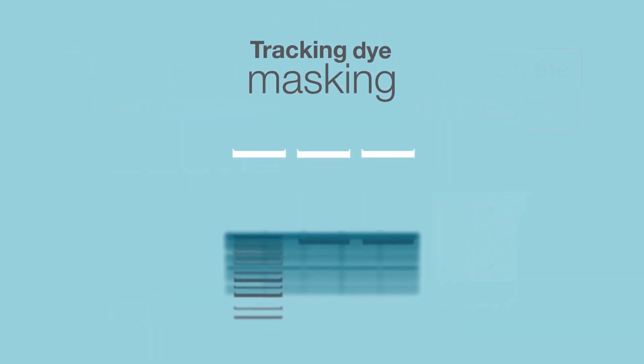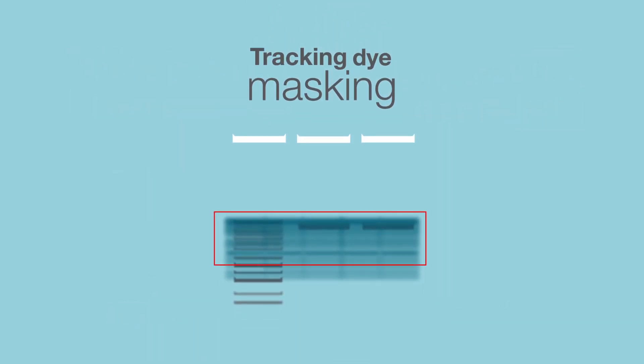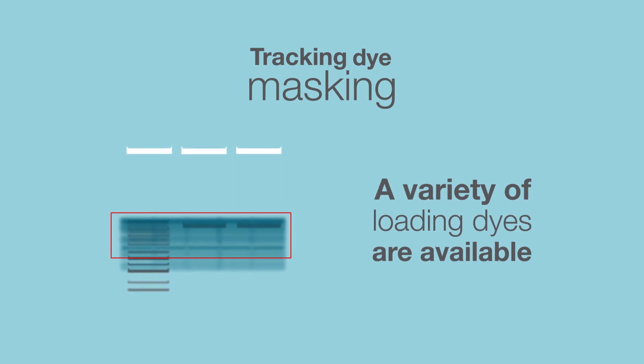A third problem is when the tracking dye masks your DNA bands of interest. A variety of different sample loading dyes are available to solve this. Choose one that won't interfere with your DNA fragment size of interest.